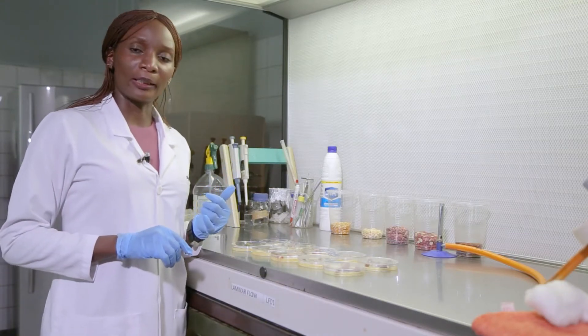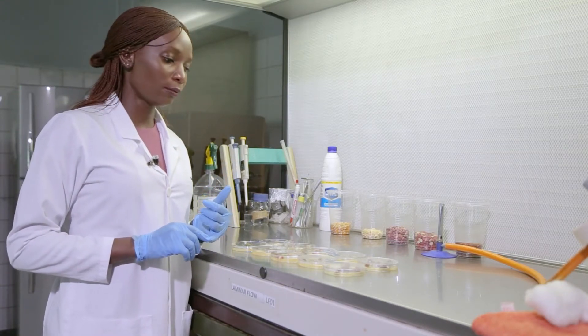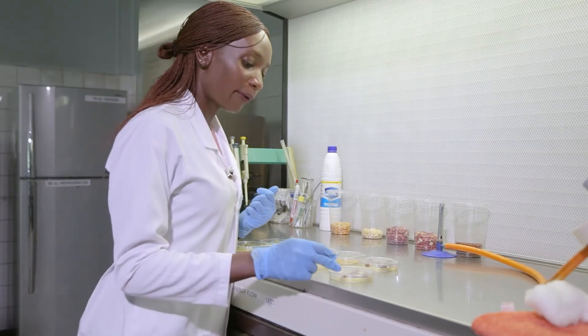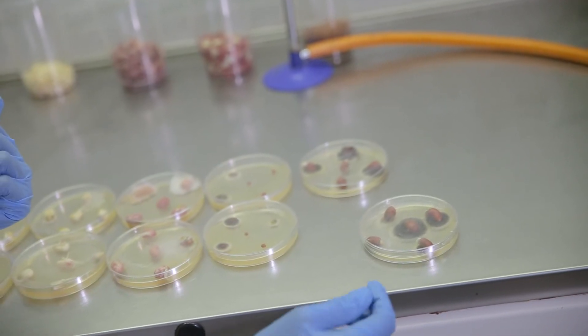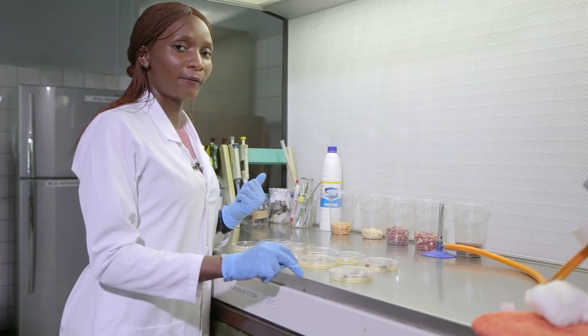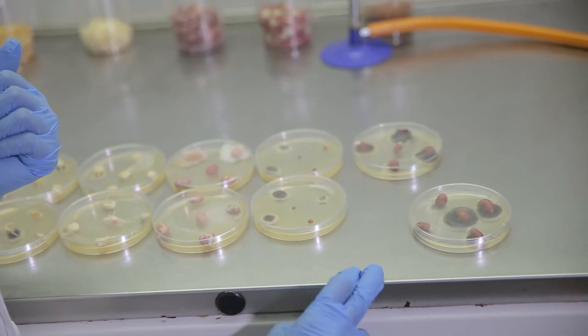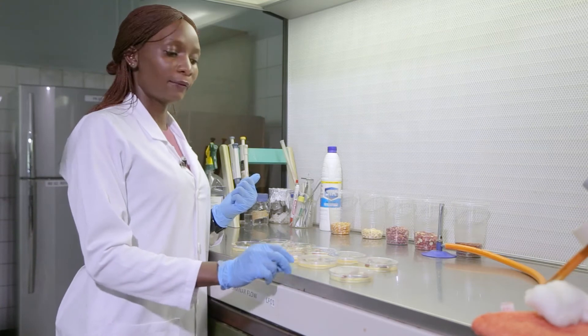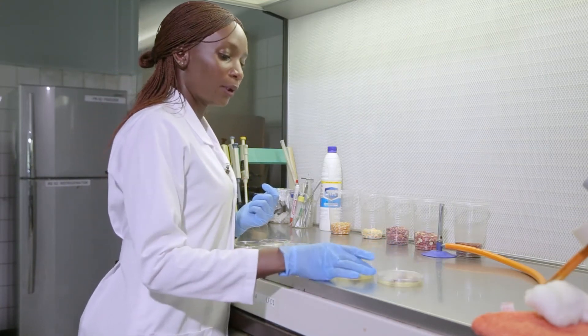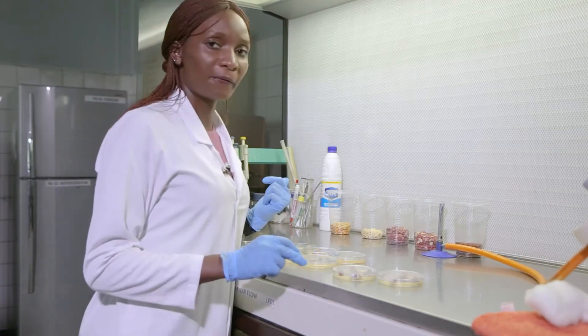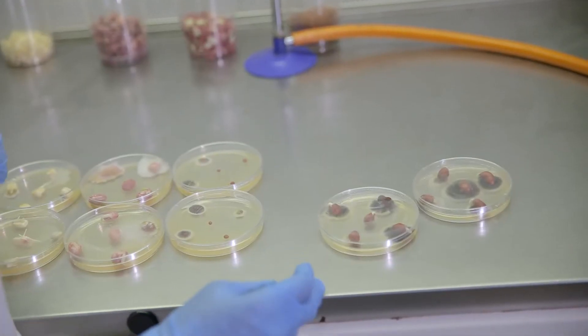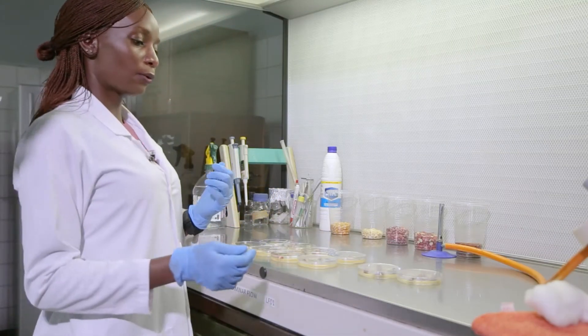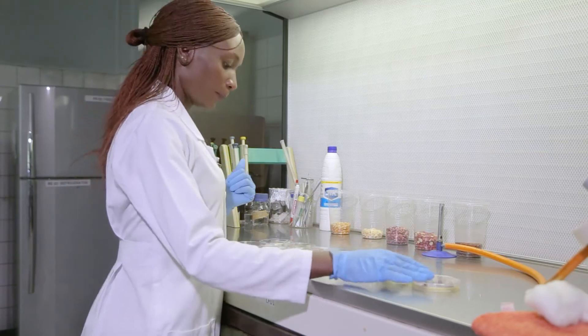The first thing that we do is to calculate percentage infection. For instance, if we look at plate A where we put our groundnut, we see that all five seeds have molds. So that will be 5 out of 5 times 100, which is 100%. When we look at the duplicate plate, we also have 5 out of 5 seeds that are infected with the fungi. So we are going to get the average. It will be 100 plus 100 out of 2, so we have 100% infection here.